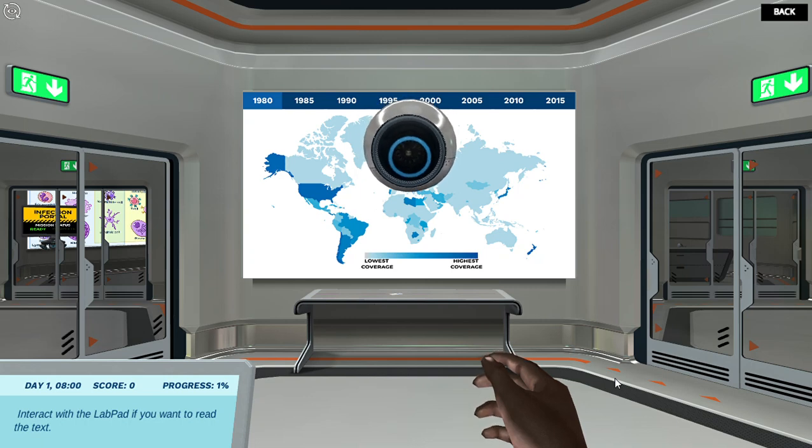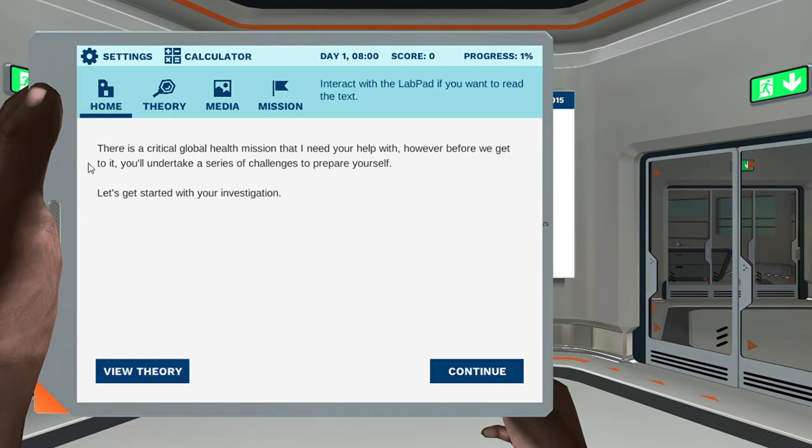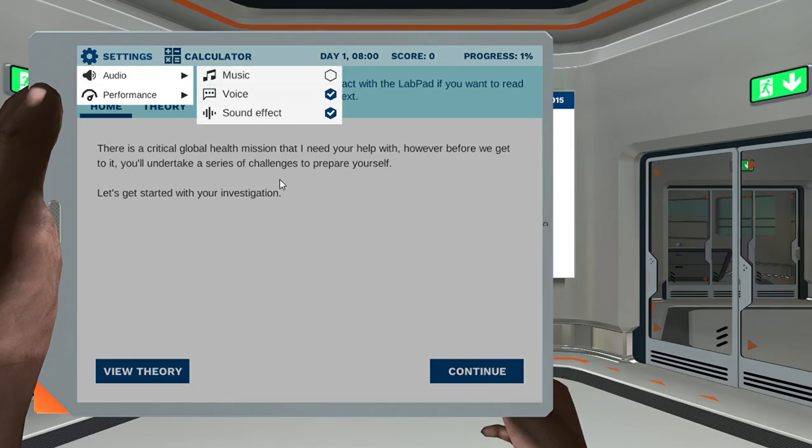You'll undertake a series of challenges to prepare yourself. Let's get started with your investigation.